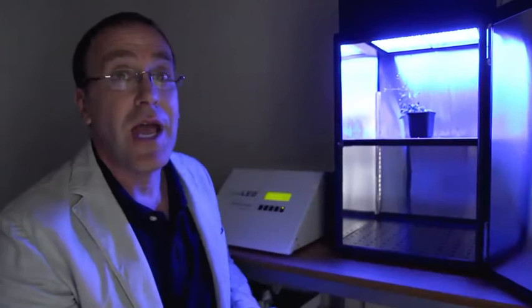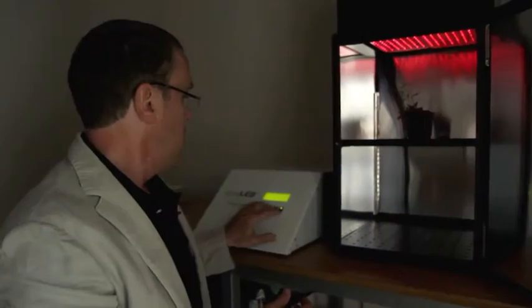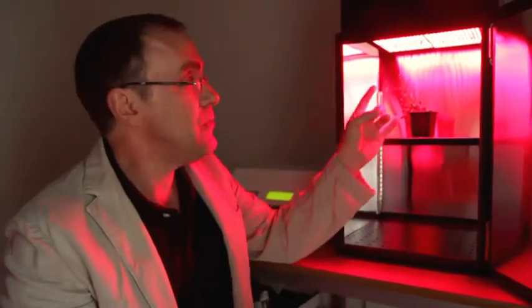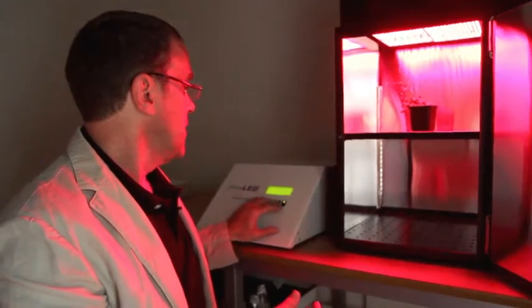So here, there's very high blue light, high intensity blue light. Or, if we want, we could turn on red lights. And now actually you could see when the red lights are on, the far red lights look like they're off completely, so we can't even see the difference. So by changing how the red lights are on and how the far red lights are on, I can actually determine whether it's in the shade, whether it's high intensity light, whether it's in the morning, or whether it's just in a normal spectrum of red, blue, and far red together.